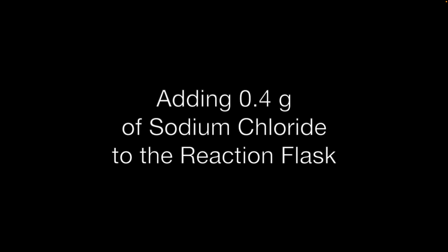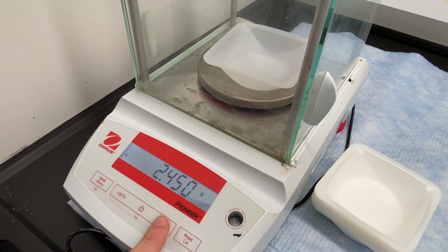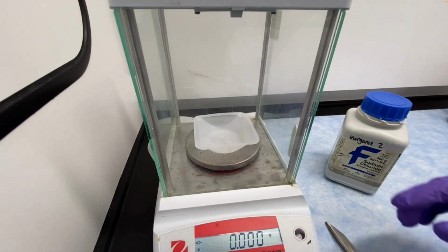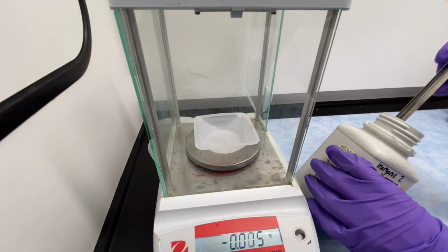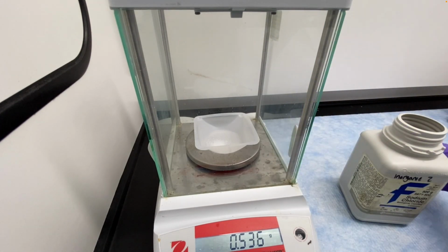The mechanism for the reaction is provided in a separate video. You'll see in that mechanism, which has 5 steps, that you need not just the Oxone, but you also need sodium chloride and water. So we're going to add some sodium chloride. This is just table salt. And the method for adding a solid is always put the weighing boat on the balance, tare it, clean your spatula, and notice how I'm shaking it. I'm not dumping it over.